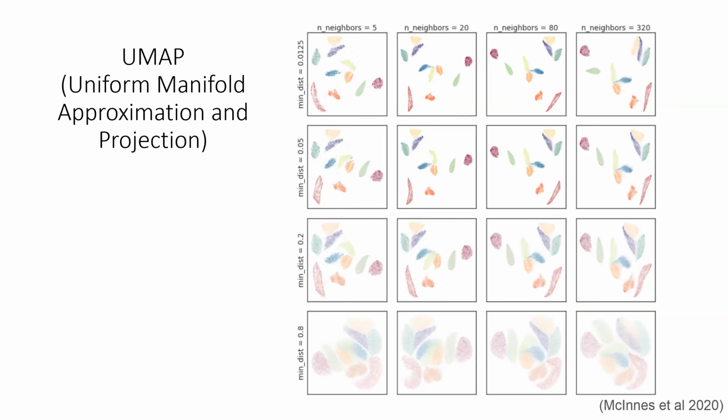Okay, PCA, yes. Typically, you can apply t-SNE or UMAP to whatever data you'd like. So you can apply t-SNE and UMAP to look at your raw data and compare it to the PCA reduced data and see if they give you similar representations of your data.